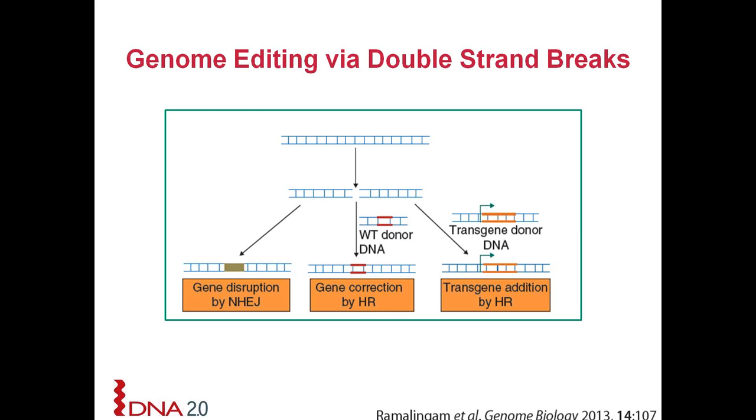Again, the way I understand CRISPR, it does not change generally how the recombination mechanism would work or any of that. It just serves as a way to select against anything that is still wild type because those get cut. So you have to still do it like you would with that host without CRISPR. It's just that this greatly enhances the efficiency of it working, so you do not need markers. You could probably get away with maybe slightly shorter arms just because this method is so efficient and you will find rarer events. But it's recommended that you do things just like you would without CRISPR, just that CRISPR will help you get away from using markers.